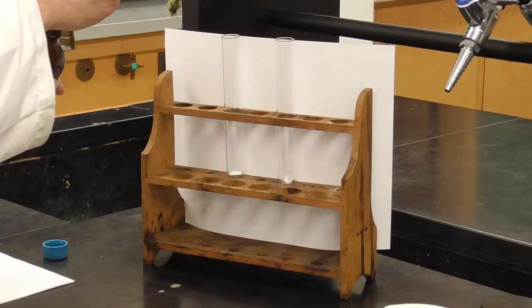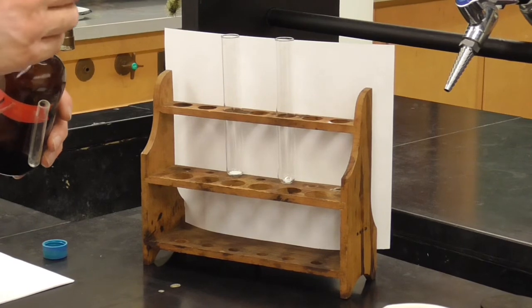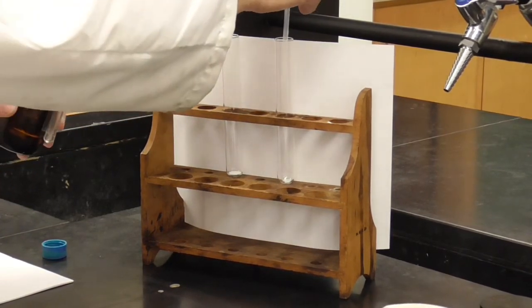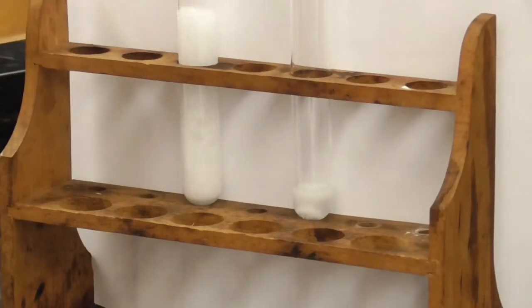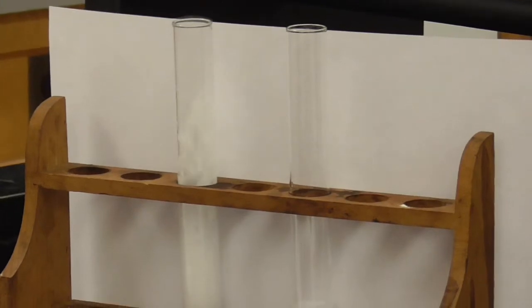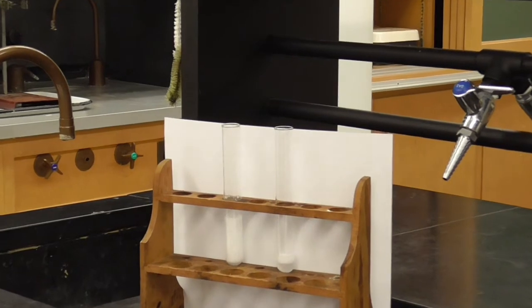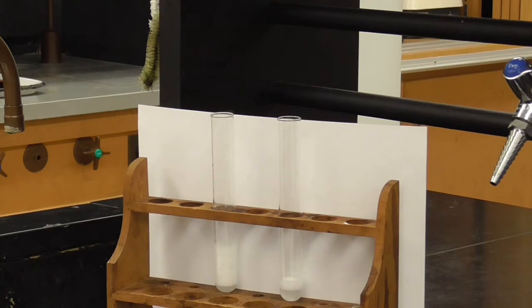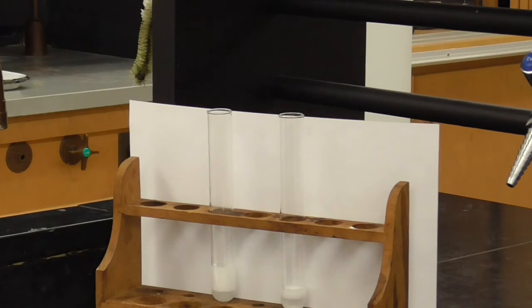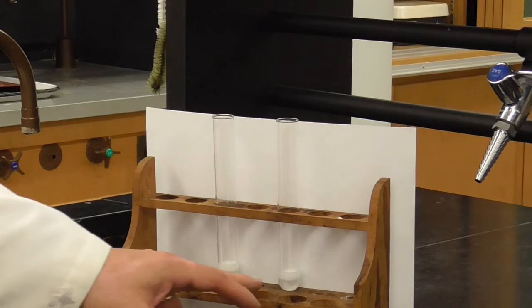And you can observe by looking at the bubbling of the CO2 being released which one is going faster and which one's going slower, so you can observe the kinetics. So here we go. There's one squirt here and one squirt here. That's a wonderful demonstration of surface area and a much faster reaction than the one that we ground up with the mortar and pestle than the one over here.